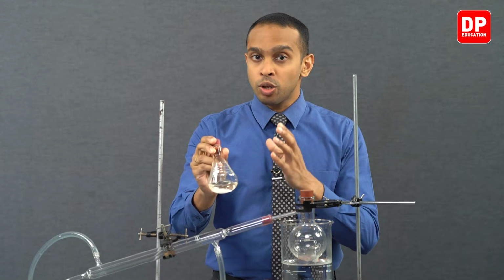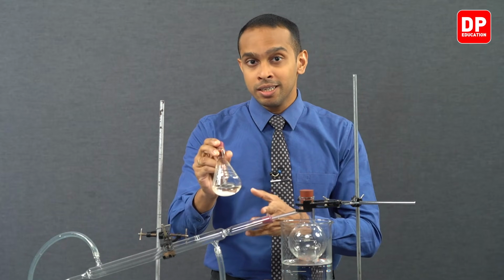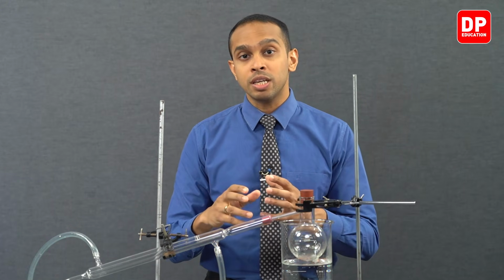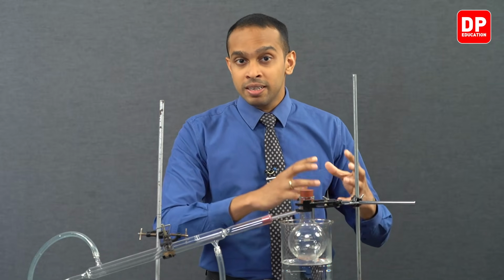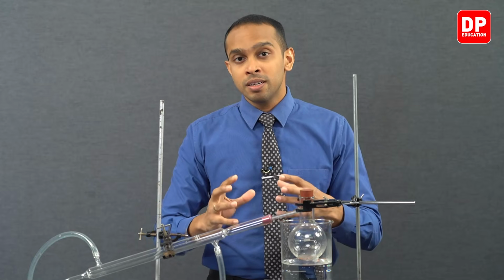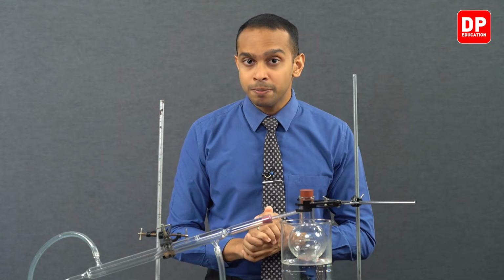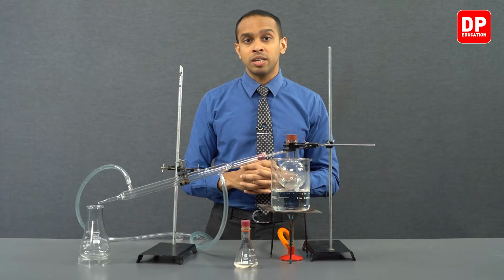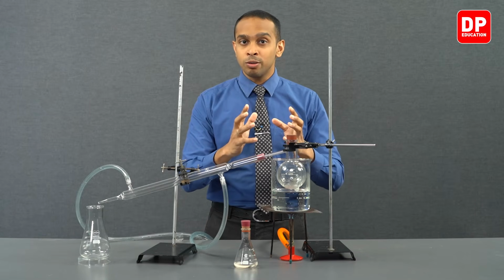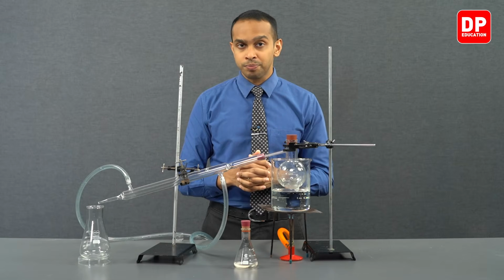Essential oil was more soluble in the diethyl ether layer than in the aqueous layer. So we saw when we were carrying out the solvent extraction process that the essential oil that was released into the aqueous layer was dissolved more in the diethyl ether layer, and with the use of a separating funnel, we were able to separate out the aqueous layer and the diethyl ether layer separately.